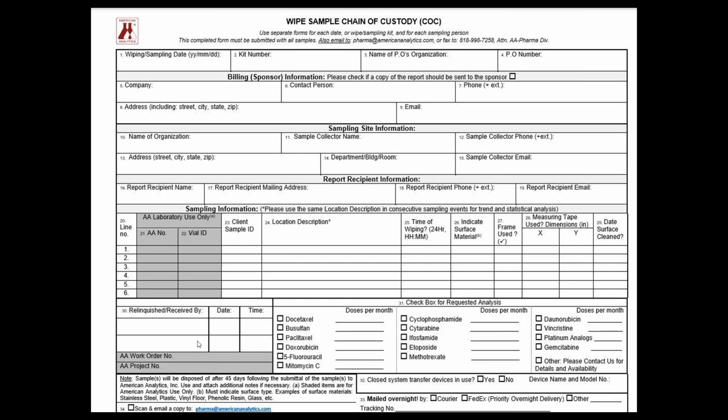And so that way we know who collected the samples. If the person who collected the samples handed them to a manager, and that manager is the person that sent it off to FedEx, the manager's going to have to sign here as well. So typically it's the person who collected the samples is handing off to FedEx, and then we sign as received by. And that's what goes here in section 30.